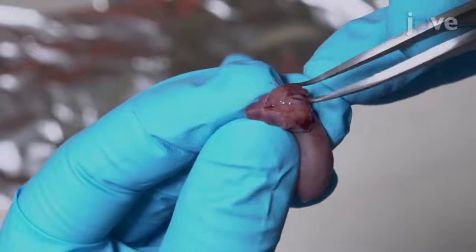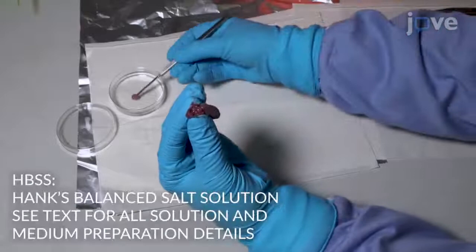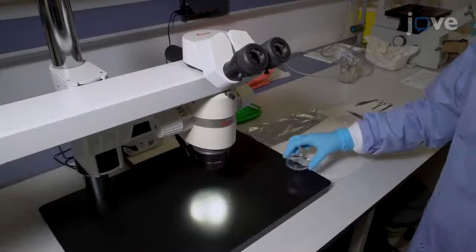Use curved forceps to peel the skull to the sides to expose the brain, and slide a small spatula under the brain to cut the cranial nerves and blood vessels connected to the base. Place the brain into a petri dish of cold HBSS supplemented with antibiotics and place the dish under a dissecting microscope at low magnification.